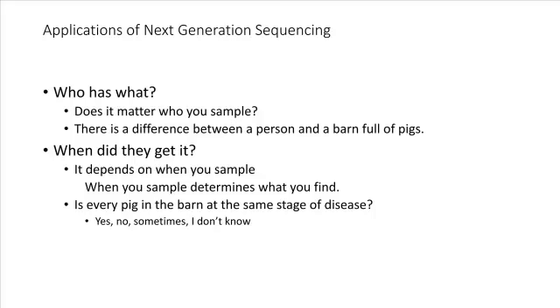So, then what sample do you take? To answer your question, do you take oral fluids? And how will that represent the pathogenesis of the disease problem going on? Do you take serum, knowing that some infections may be transient in the serum? Do you take tissues every time? Do you take fecal samples? And so trying to relate these again back to who has what and when do they have it can be difficult. And again, part of the frustration that we're going to come across trying to understand these results.